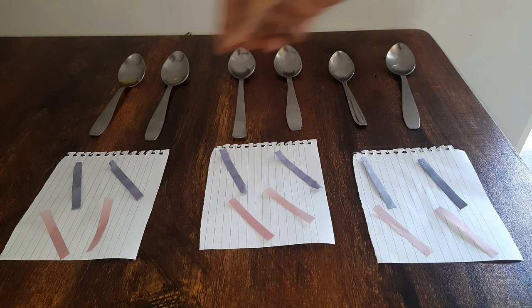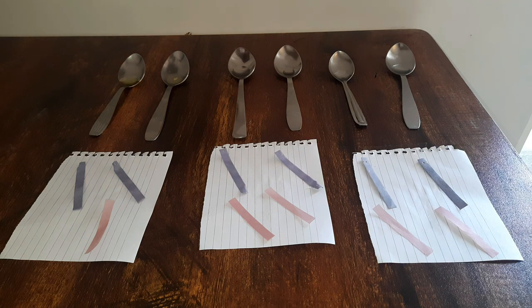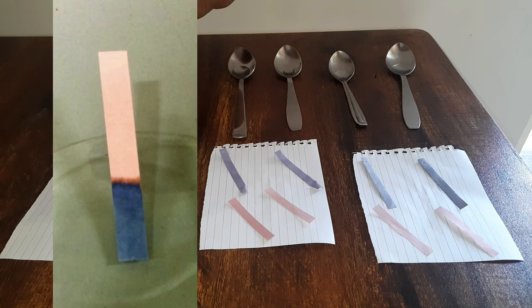Let's start with the red litmus paper and bring it in contact with the liquid detergent. The red litmus paper turns blue. So this means that liquid detergent is a base. A base can turn a red litmus paper blue.